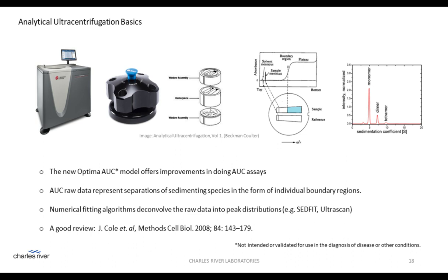Numerical fitting algorithms take this raw sedimentation data and deconvolve it to a peak distribution profile, such as the graph seen at the very far right-hand side, which we can readily observe and quantify. It's that final product, that final data, that we can look at and quantify.